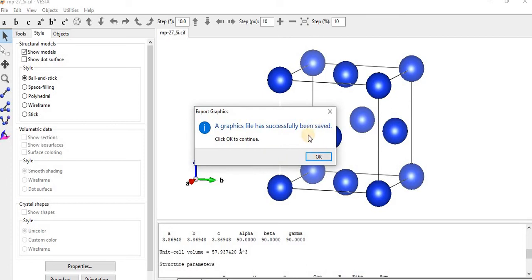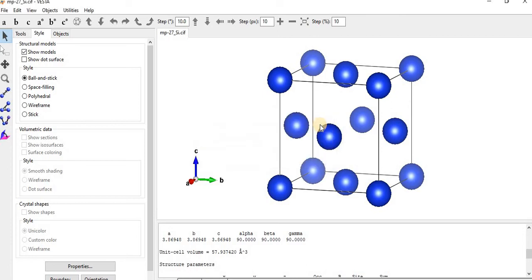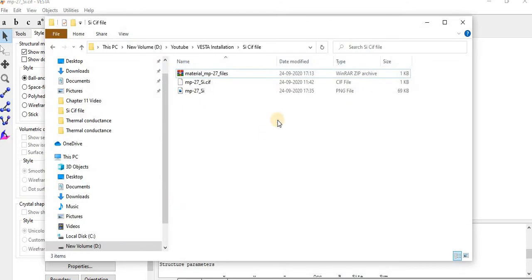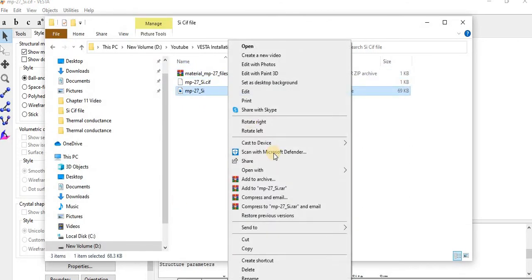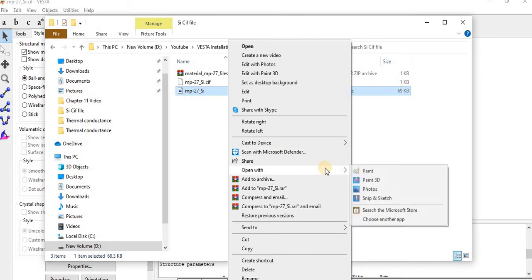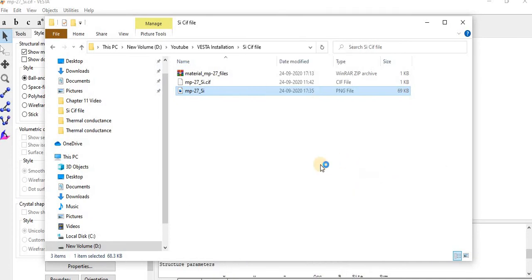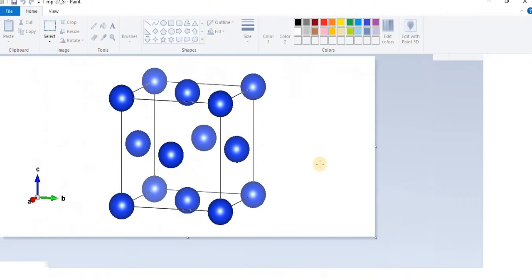This has been successful, so this image is saved in PNG file. Let me view this image. So this is the view of the same crystal structure.